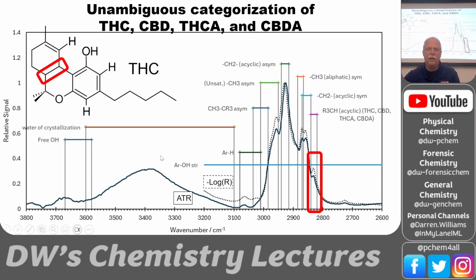So this is if we just take a spectrum unambiguously, if we look at this region right here, we know we have one of these 4 compounds. So that's good for discrimination. At least we can knock 3 of them out of our mixture.